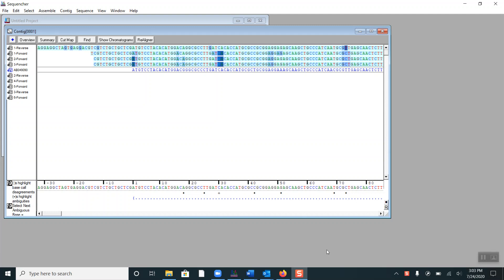Hi, this is Jillian from GeneCodes Corporation. Today we're going to look at how to edit aligned sequences in Sequencher. This is the sixth video in the tour guide of Sequencher series.